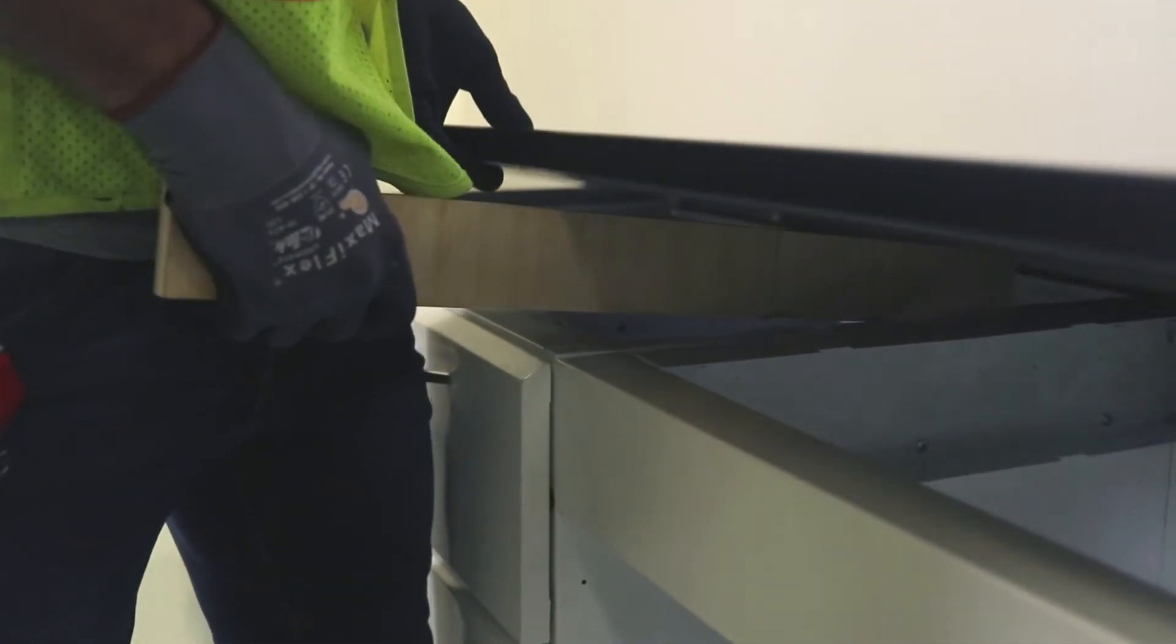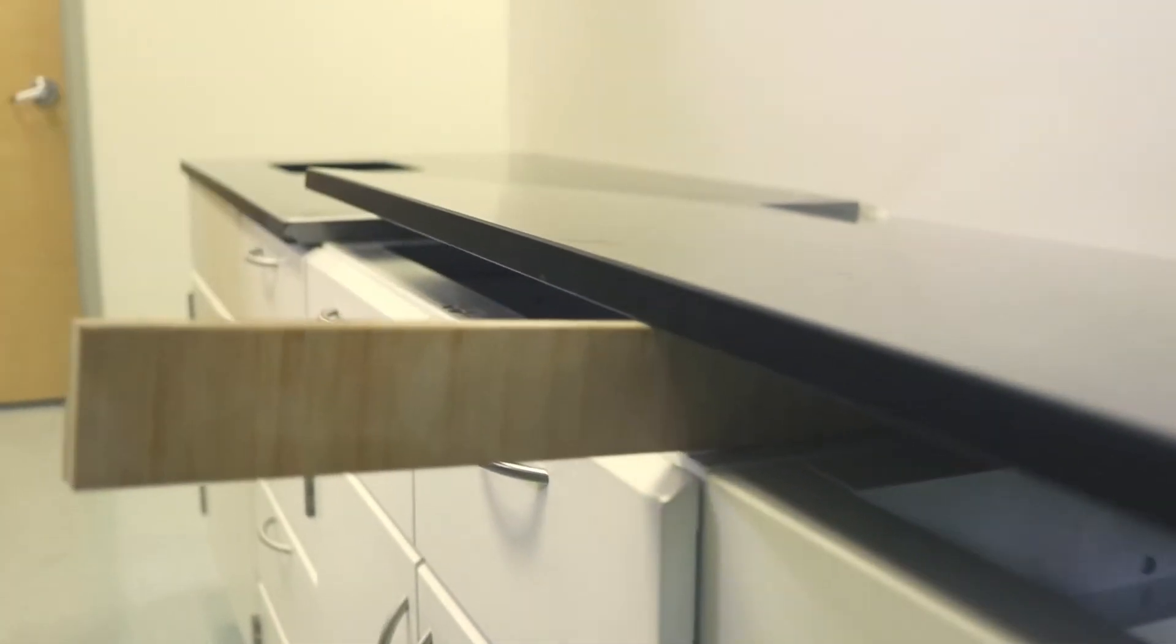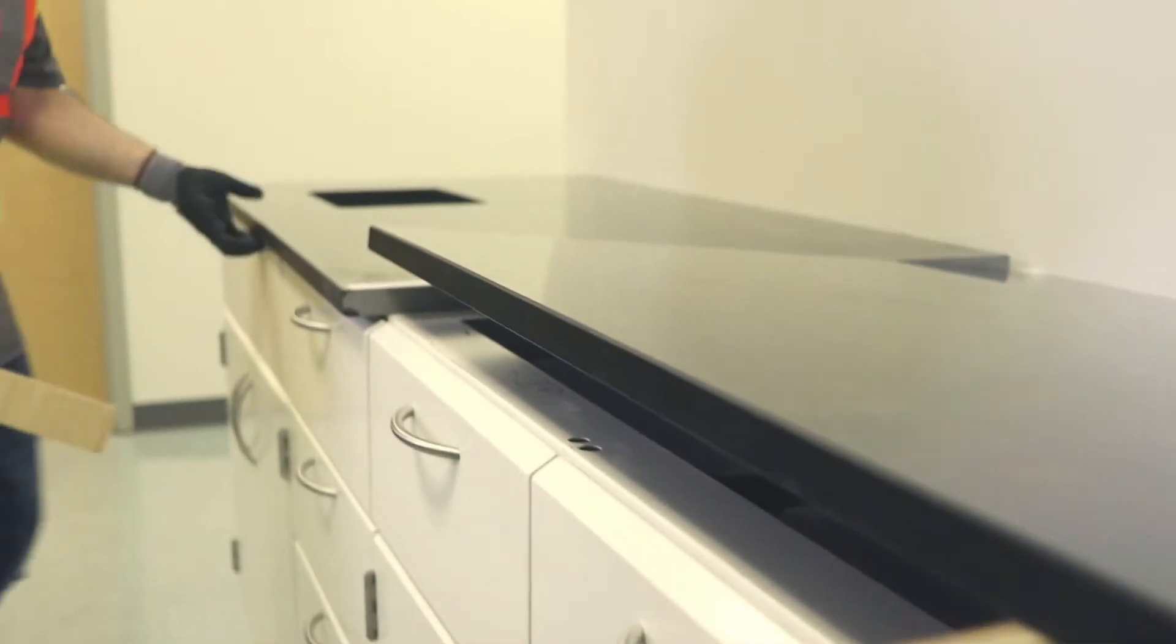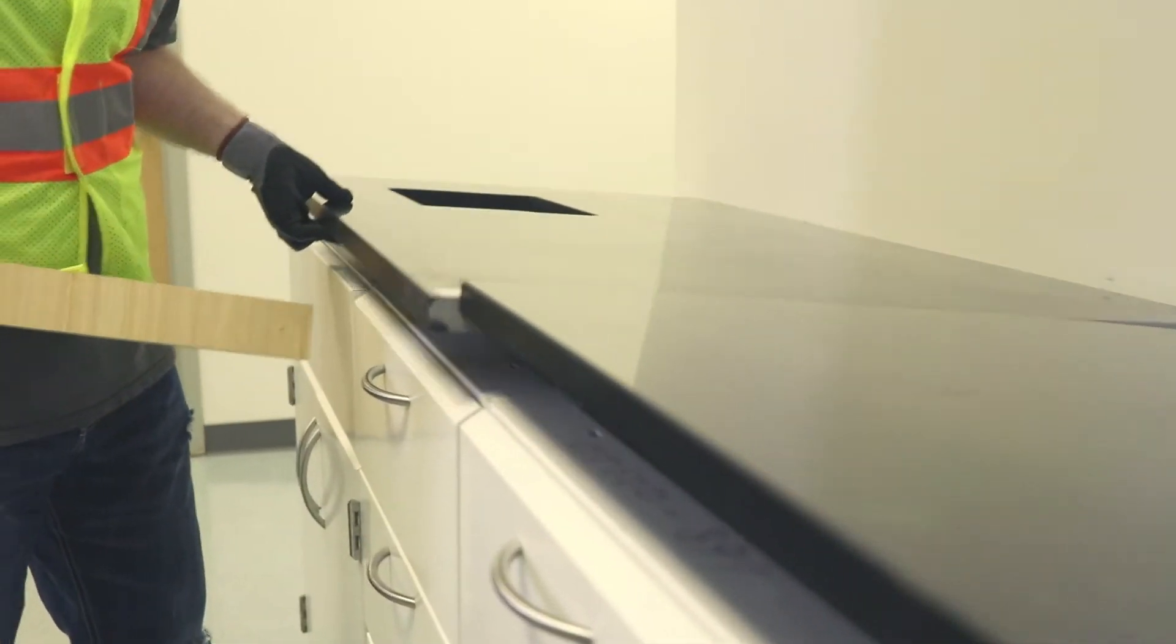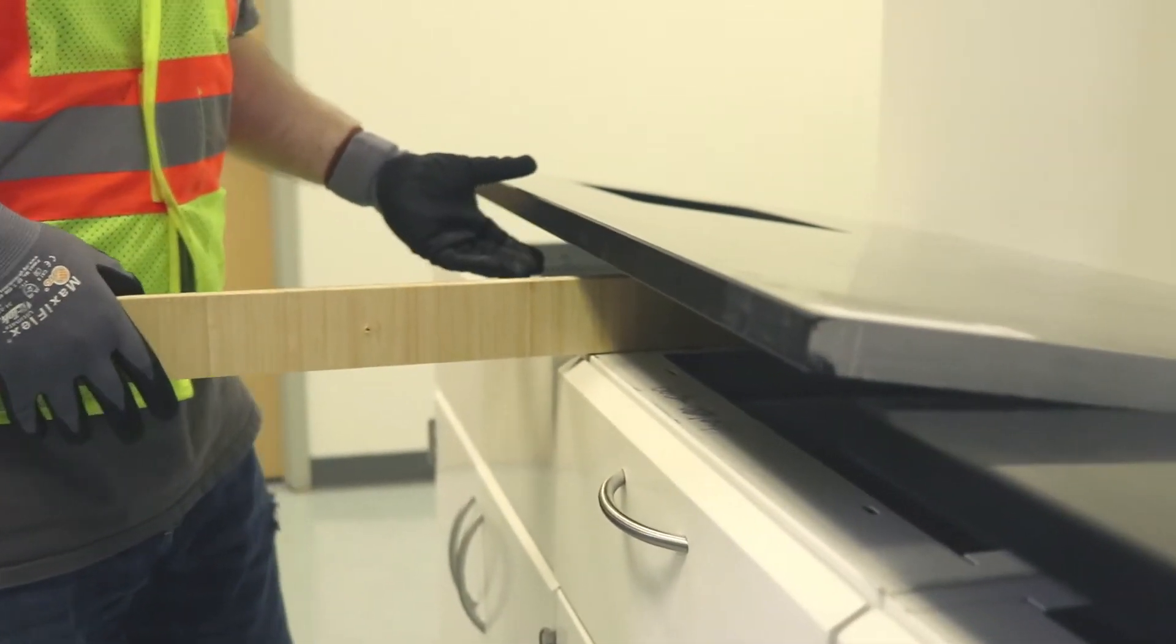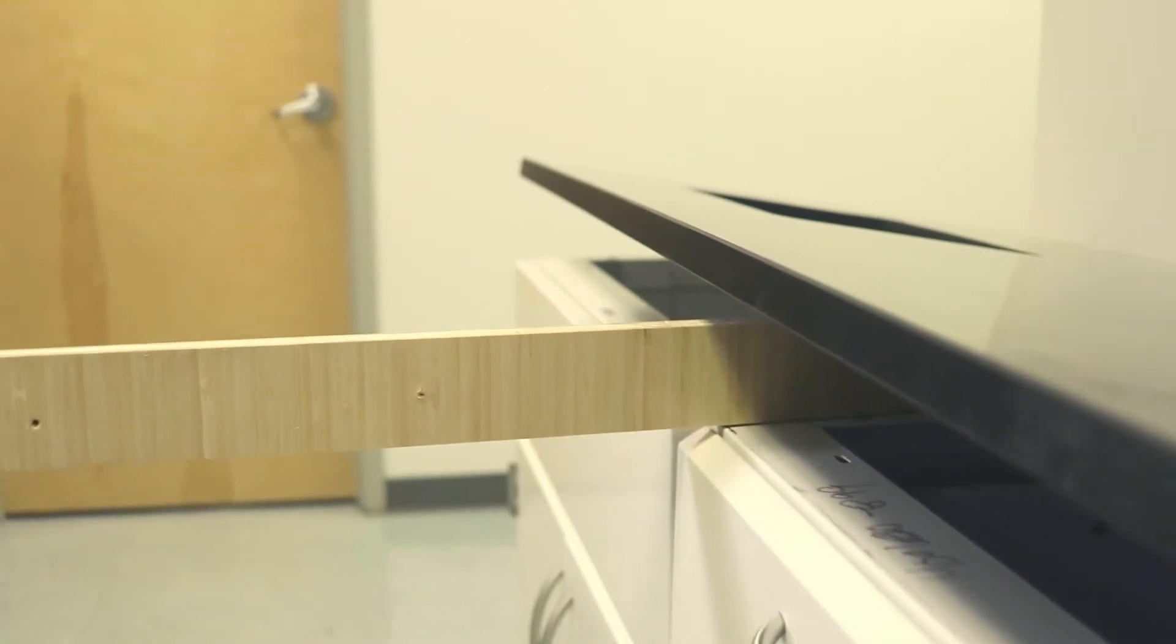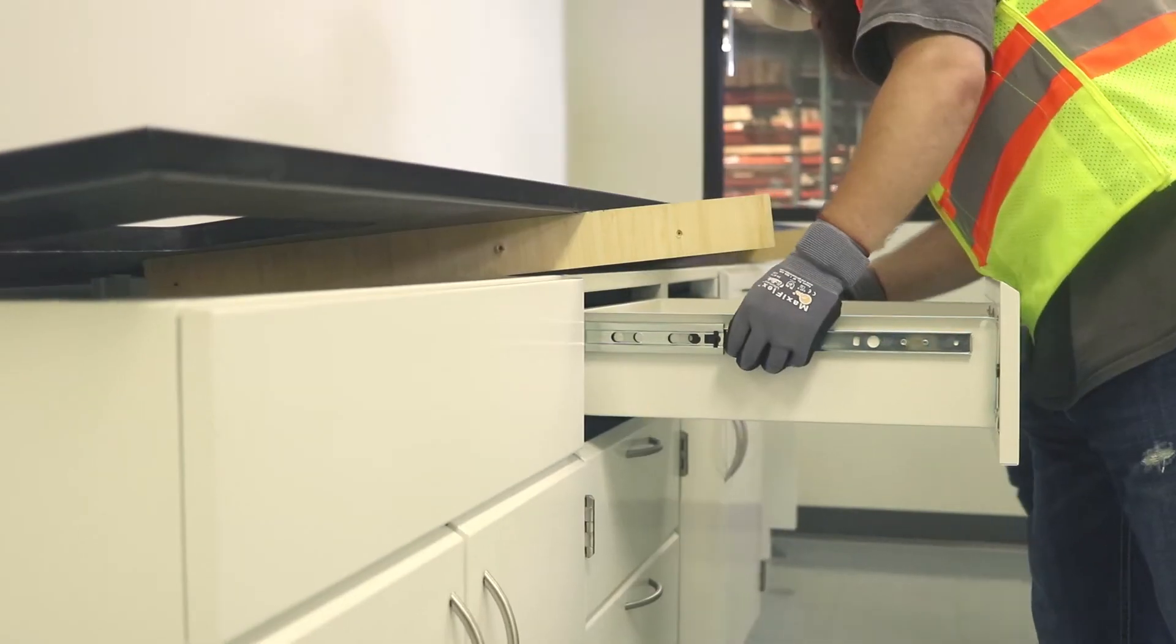boards are inserted between the surface and the cabinet which leaves a space for the silicone to be applied. The upper drawers are also removed in order to have more space to work.